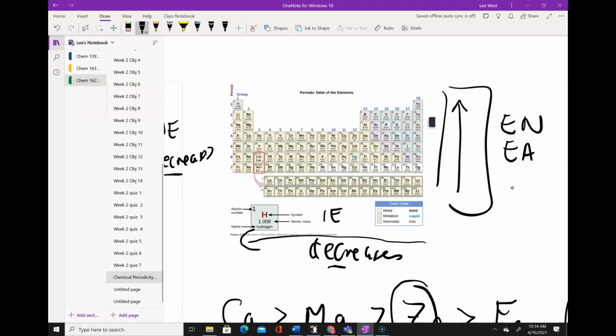All right, let's see what happens when you look at that. Now, we're not going to be looking at astatine in these halogens because astatine is radioactive. But you could probably predict the reactivity of astatine once you've looked at chlorine, bromine, and iodine.